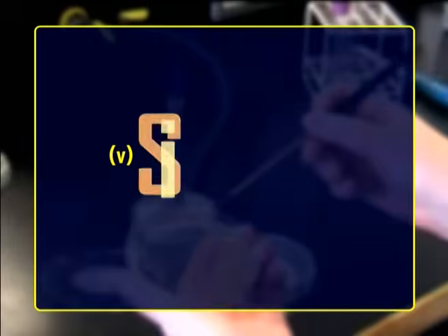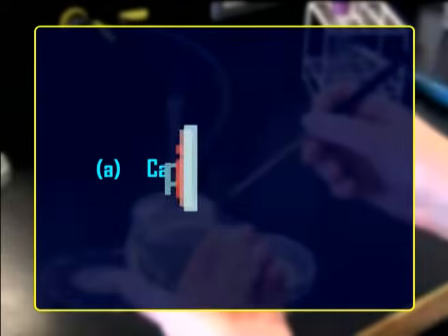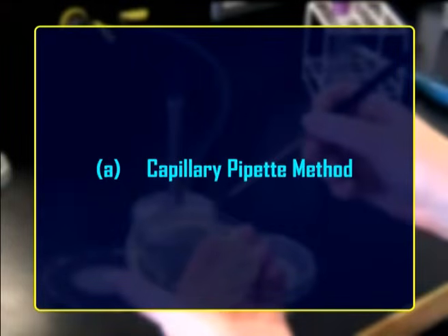Yet another important technique of isolating pure culture is single cell isolation method. An individual cell of the required kind is picked up by this method from the mixed culture and is permitted to grow. The following two methods are in use. First one is capillary pipette method.